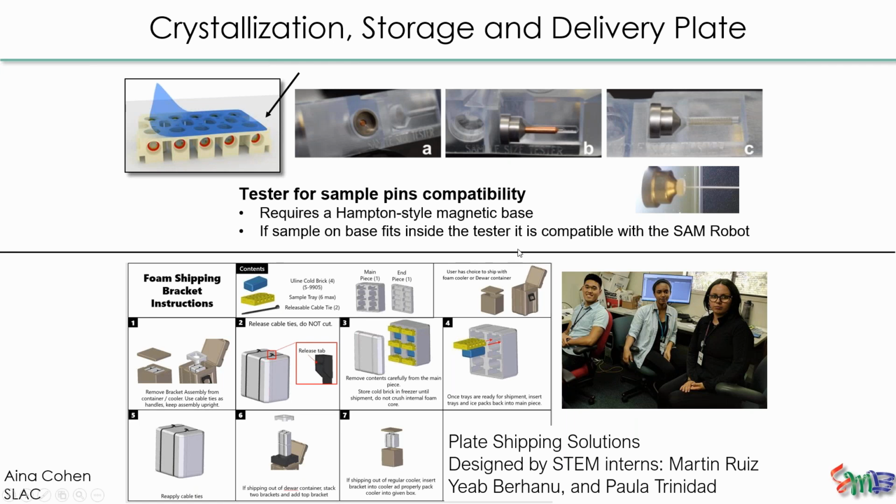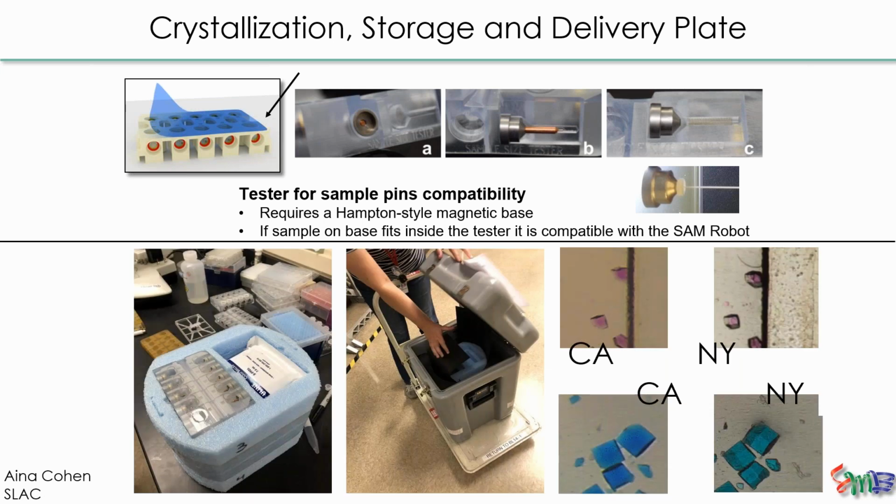So first of all, there was an initial setup for how these might be shipped, and these were developed by some interns at SLAC, at SSRL, to figure out how we could set this up to ship room temperature crystals with really no manipulation. So this was the prototype, and we tested this about 2 weeks ago. This is now the prototype. So here's an actual image of the tray in the blue box here, and they're being set up in a dewar, mostly to keep it upright.